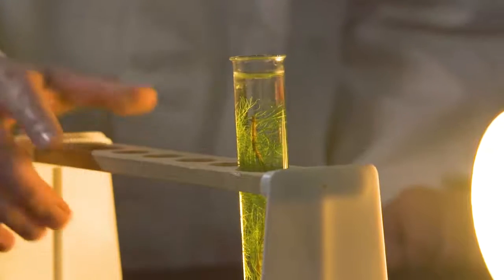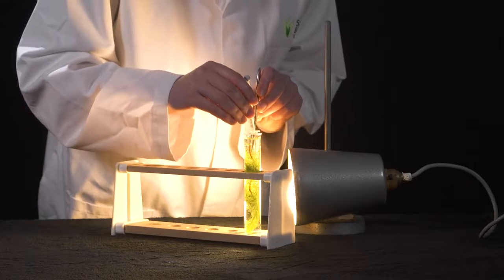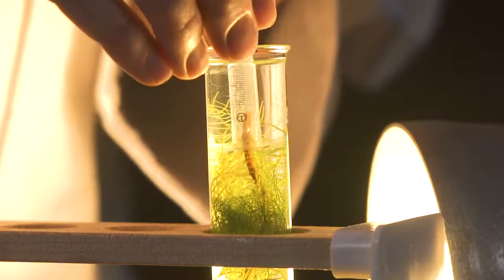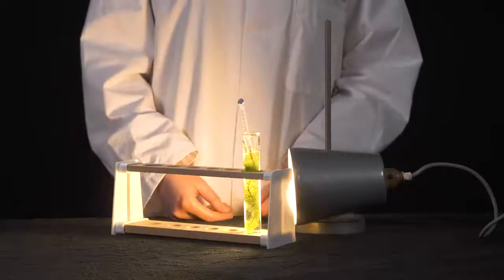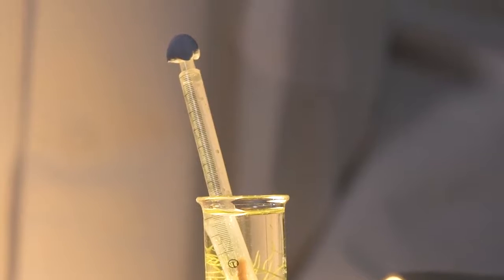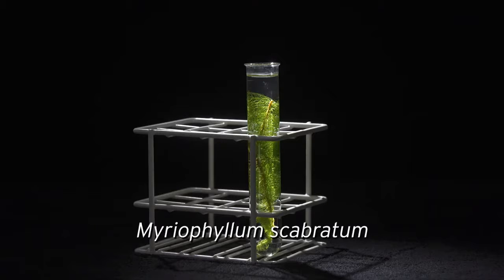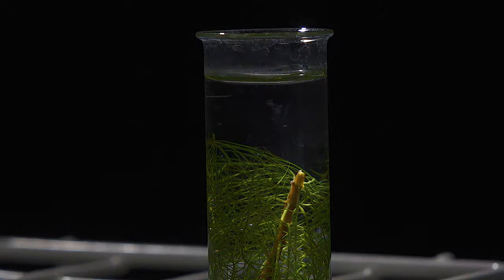Younger students can simply count the bubbles produced in a set amount of time. Older students can collect the gas in a microsyringe or pipette and get a quantitative measure in this way. The visible difference in the gap between bubbles produced can also be used to show students that the rate of photosynthesis is changing quite rapidly in response to light level.